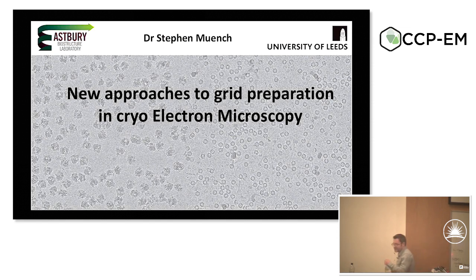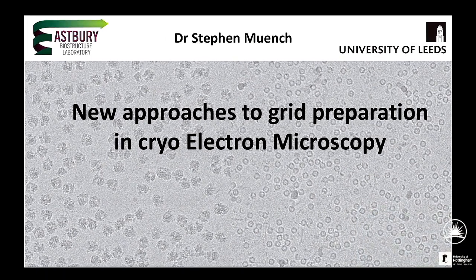Thank you very much, Tom, and thanks for the invite to come and speak today. So this is going to be a little bit different compared to some of the other talks. And if we've learned nothing else this morning and yesterday, I think there's a lot of different ways of making EM grids. And to some extent, what we need to consider is what the scientific question is that we're trying to address.